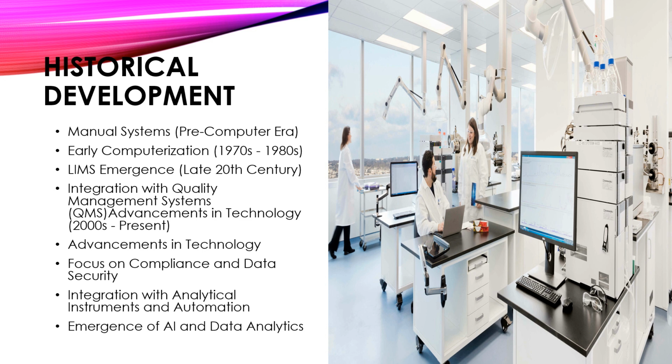Advancements in technology. With advancements in technology, including the proliferation of the internet, cloud computing, and mobile devices, laboratory management systems evolved to become more accessible, scalable, and user-friendly. Cloud-based laboratory management system solutions enabled remote access to laboratory data, collaboration among researchers, and real-time monitoring of experiments.